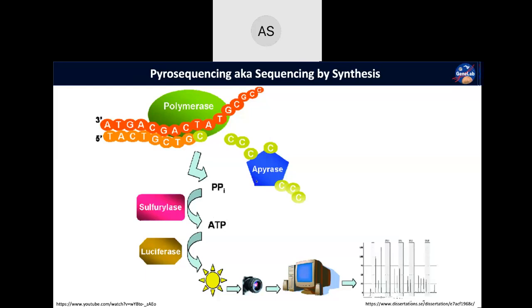It's definitely faster than Sanger, but of course limited in the fact that we're only trying to look at one nucleotide incorporation at a time. So what several companies did and what Illumina really perfected is being able to add all 4 nucleotides at a time. And basically Illumina does this for simplicity's sake. This is how it first started, is adding each nucleotide being tagged with a different color fluorophore. And so basically you would know what base was being incorporated in as you're generating your growing sequence here based on the color of the signal that's being released.